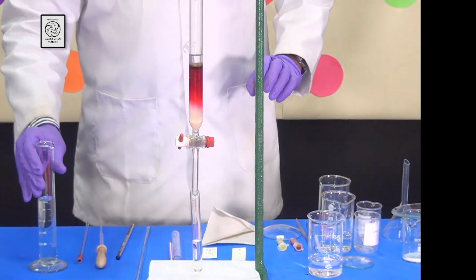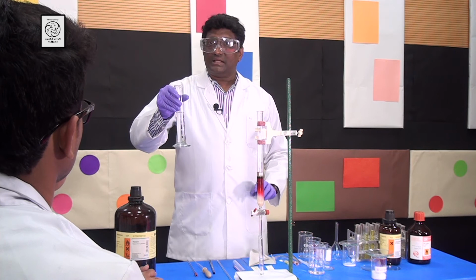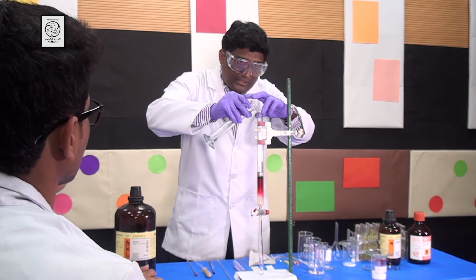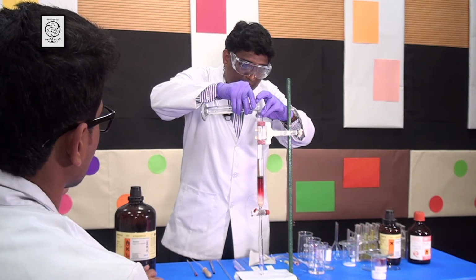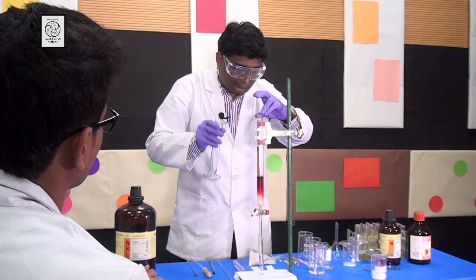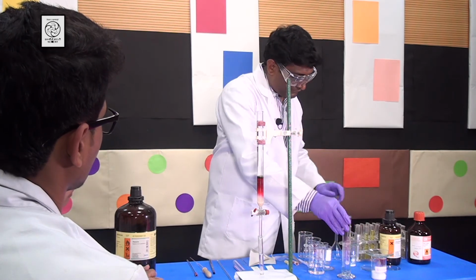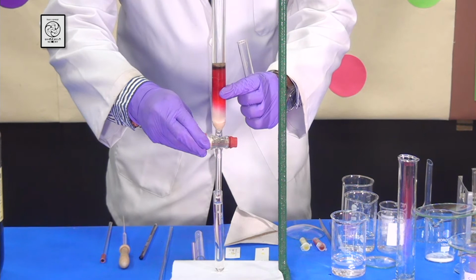Here you can see I have a mixture of 50-50 hexane and ethyl acetate. Now, I am going to pour it here to elute my red compound. Again, pour it carefully so that it does not disturb the top layer. So, I will increase the speed a little bit.